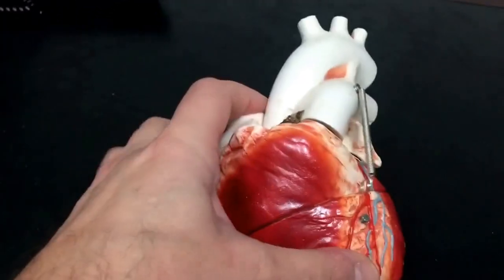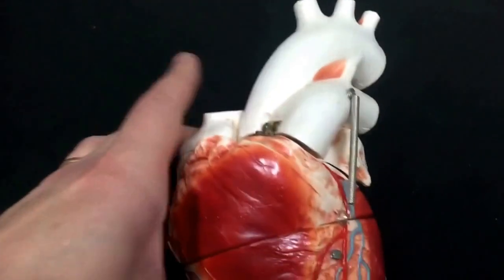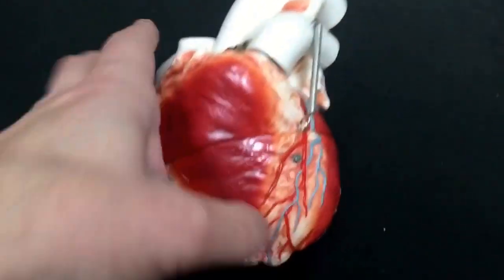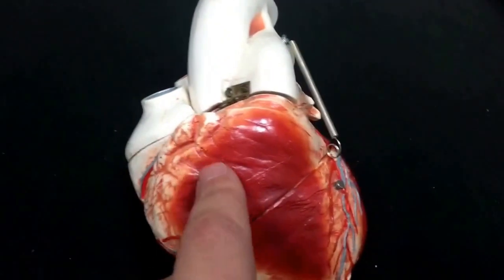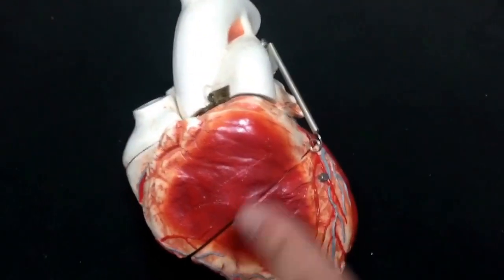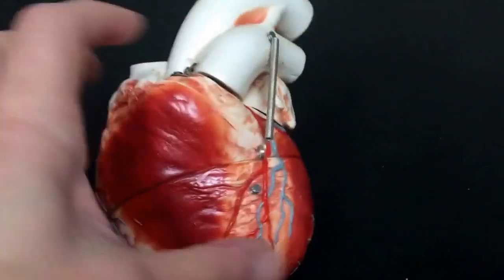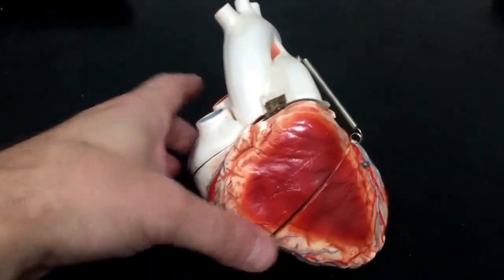So you might want to experiment, and we'll decide how we're going to do it. I haven't quite decided how we're going to, if I get a heart tube, I'm not sure how I'm going to do it. Typically I just start incising in the atria and cut all the way down through here so that I can open up the right ventricle, and then I open up the left ventricle. But we can decide when we get there how we're going to dissect this.